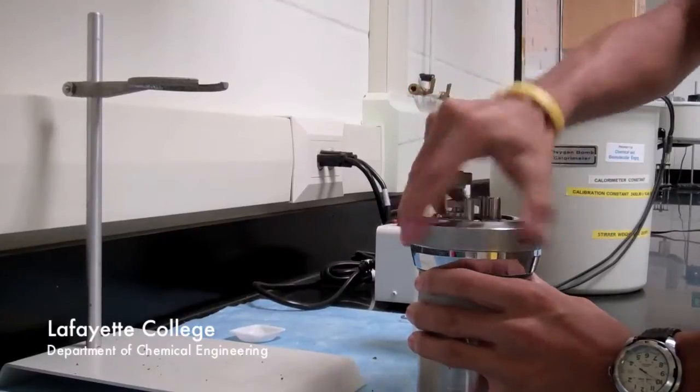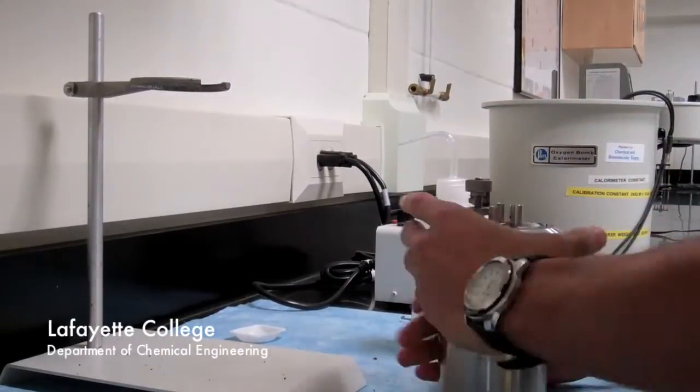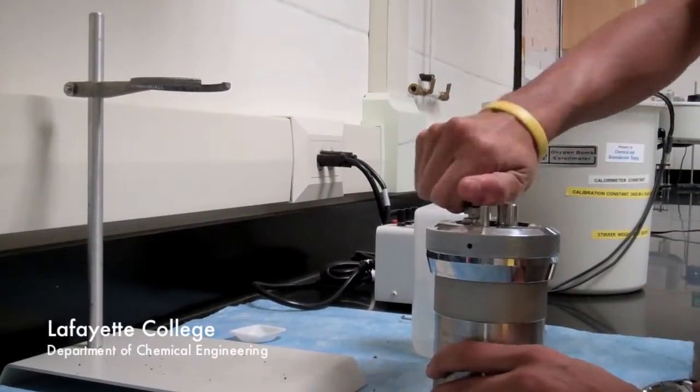When the cap is fully tightened, turn it back a little so that you will be able to remove it after the experiment is complete. Next, close the gas release valve by tightening it fully. You are now ready to pressurize the bomb.